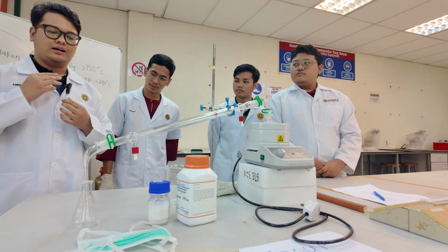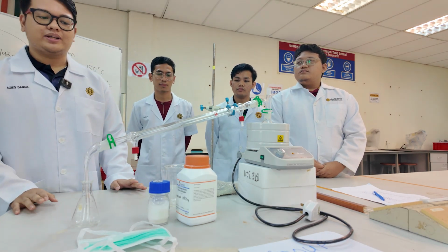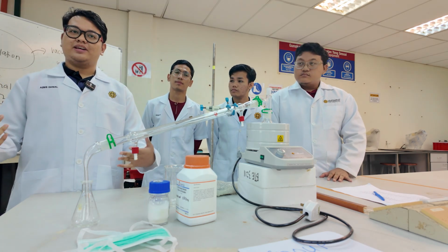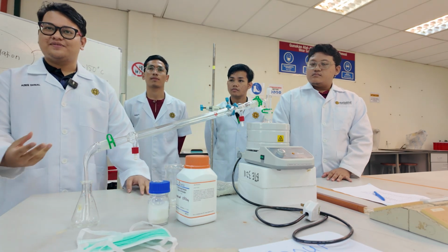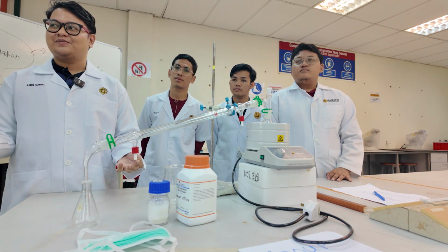So the next precaution that we need to take into account is that dealing with distillation, we may also deal with some volatile solutions, right? What does volatile solution mean? Do you guys know what it means? Don't know. Okay.